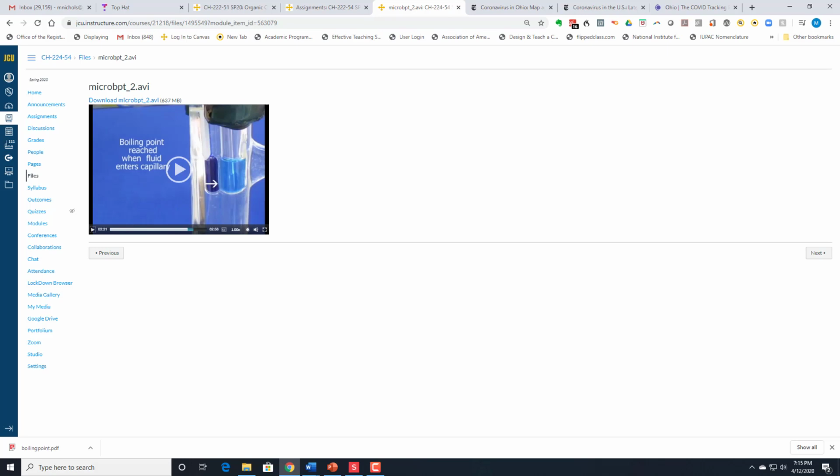So you can go back and watch this video, and they'll take you through all of the entire steps. But that's how we would have measured a micro boiling point.